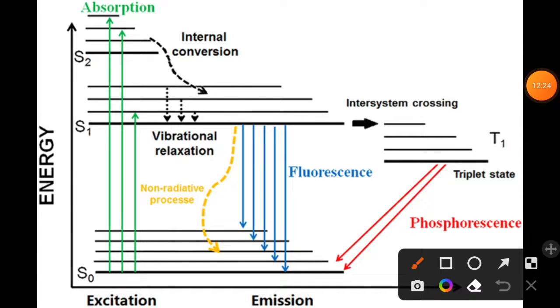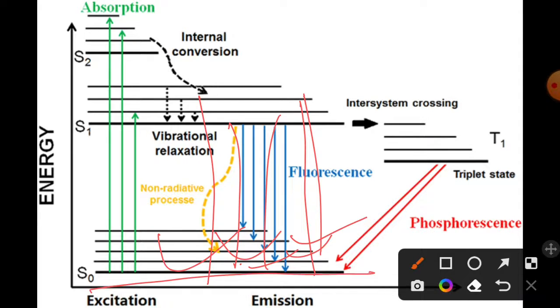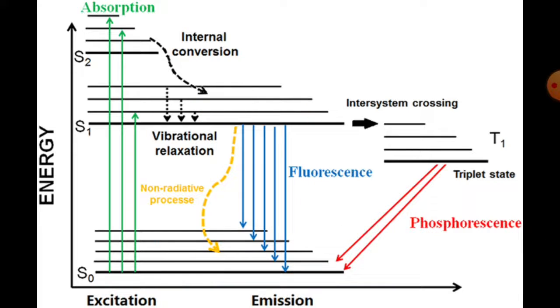So they will release all of the energy and they will go back to their ground state. During this travel from the excited state to the ground state, the fluorophore will release light, or those trapped energy inside the fluorophore during its excited state will be released in the form of light. Okay, and this light is known as emitted light. Clear? So this emitted light will help us to create an image of the specimen with the help of fluorescent microscopy.